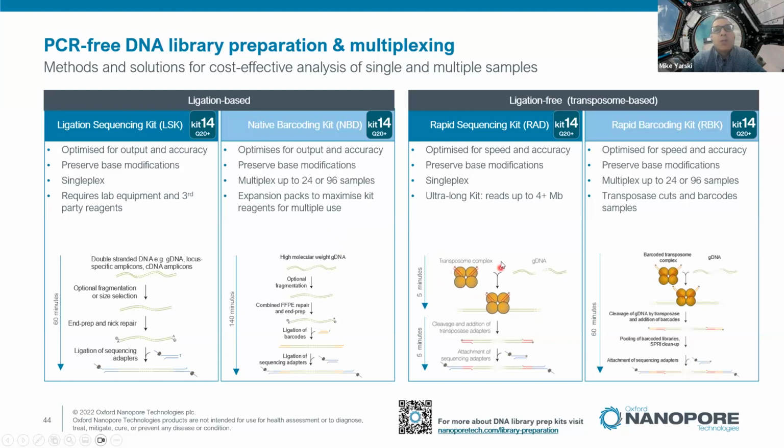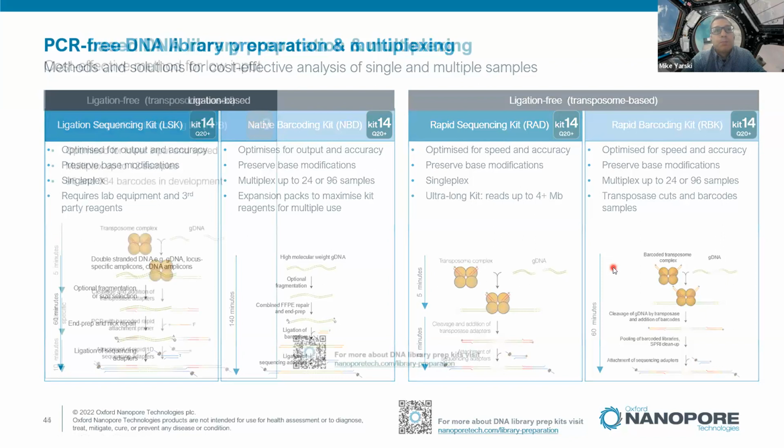And again, there's a transposase complex with the transposase adapters. You will find a transposase site, nick the DNA, add the transposase adapters, and then you simply do a 5-minute incubation and add the sequencing adapters in sequence. And there's a multiplex version of that as well.